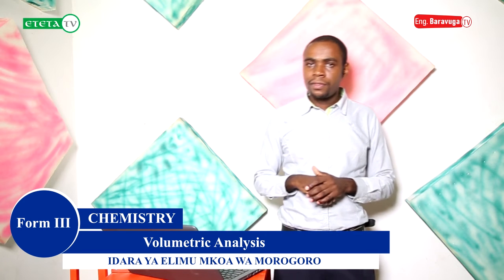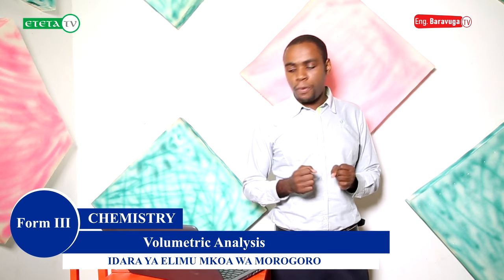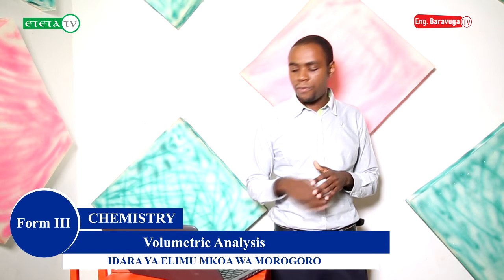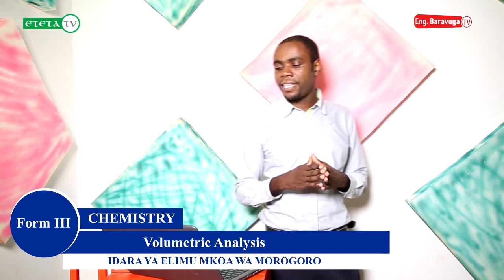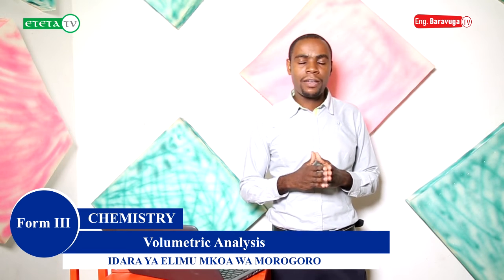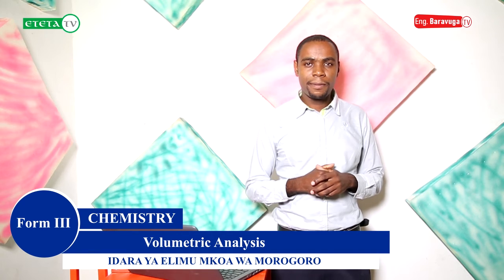Now, let's go to the first subtopic, which is called the standard volumetric apparatus. The following are common laboratory apparatus which are used for volumetric analysis.